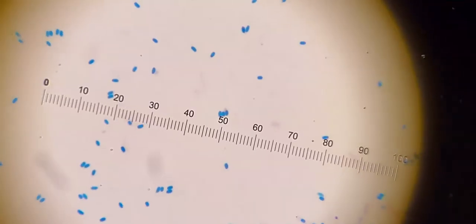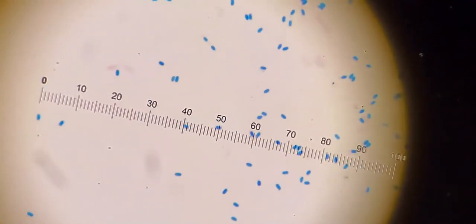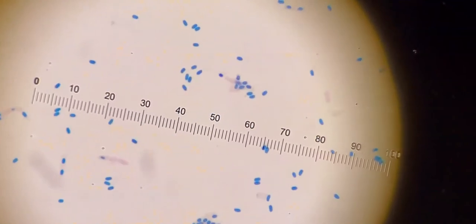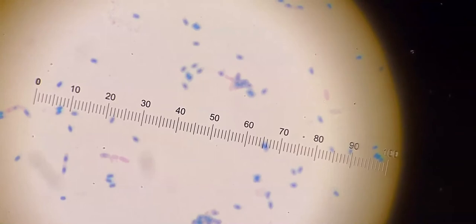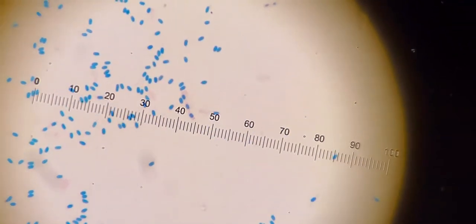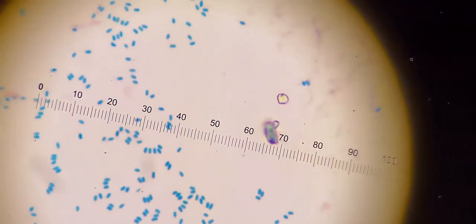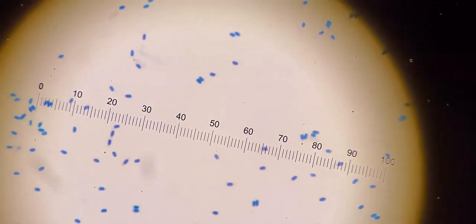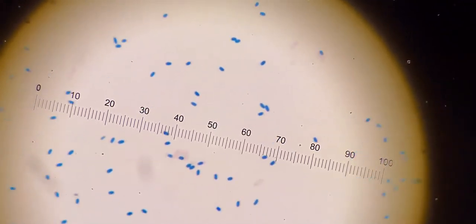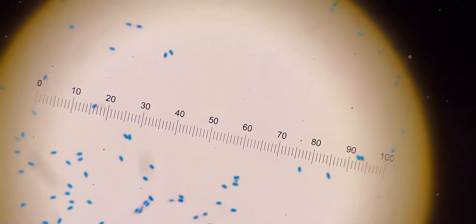Here we can see the results from one of our endospore stains and you can see that nice sort of bluish green or cyan color. The one thing that is lacking from scanning around here is the cell bodies. Here we can see a few of them. When you see a field where the majority of the specimens are lacking those cell bodies what's gone on here is more than likely all of the cells that were in there actually went ahead and did this process of sporulation. We can't really speculate about the cells from this particular specimen unless we can find a red cell body with this spore on the inside.